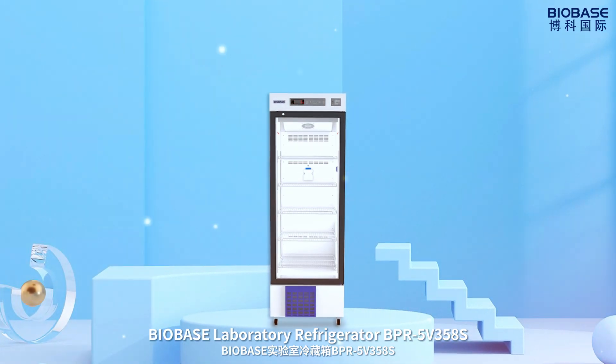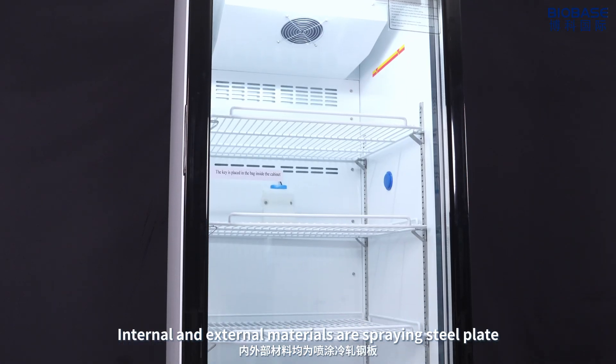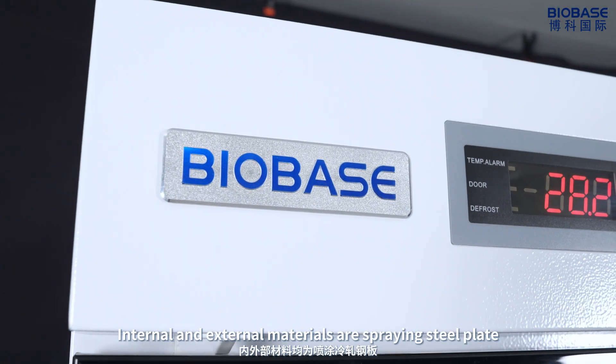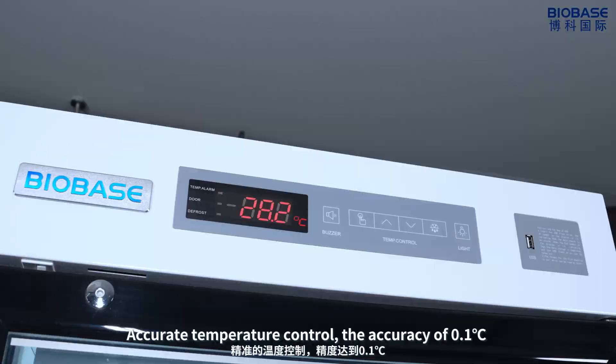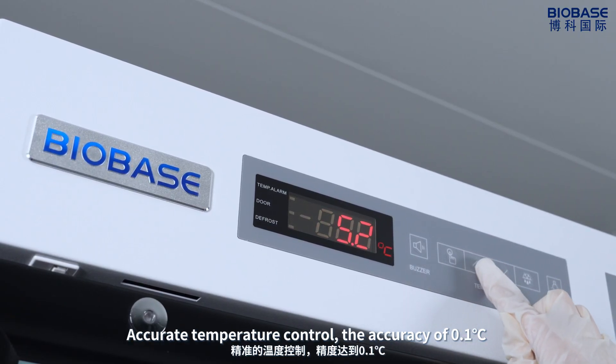BioBase Laboratory Refrigerator BPR-5V358S. Internal and external materials are spraying steel plate. Accurate temperature control with an accuracy of 0.1 degrees centigrade.